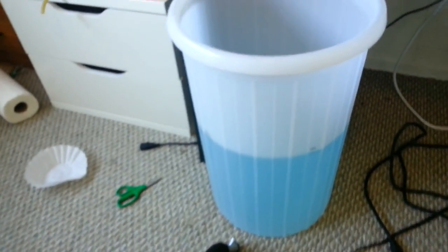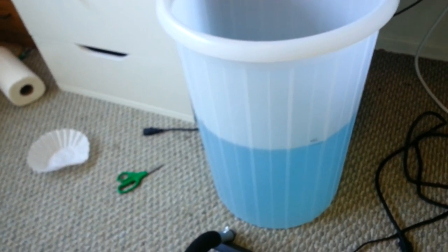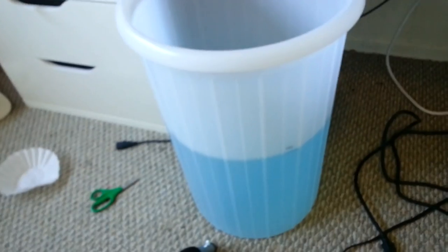It's blue because I put some bleach in it to keep stuff from growing. Don't use too much bleach so that it doesn't start corroding the pump or anything like that — I don't even know if that can happen, but you never know.